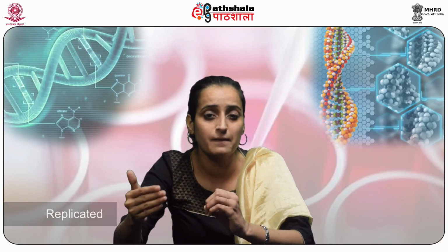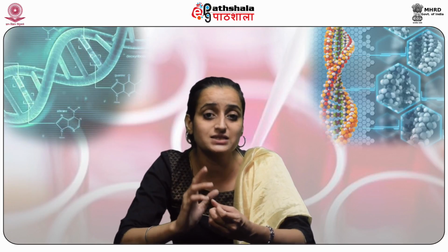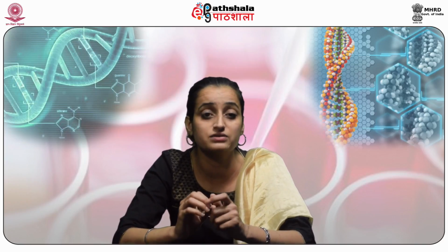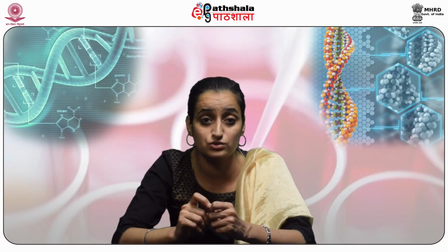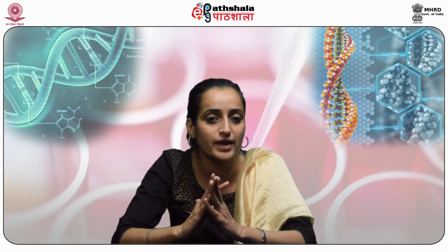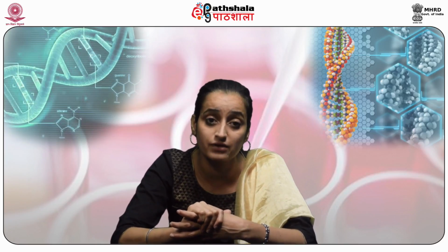The fragment can be cloned in a plasmid, replicated in bacteria. Bacteria then can be lysed to obtain the plasmid, and the plasmid is then purified, and in the end, restriction enzymes can be used to excise out the fragment of interest to be used as a probe. RNA probes, on the other hand, are 250 to 1000 base pairs in length. RNA-RNA hybrids are very thermostable and are resistant to digestion by RNases. So, post-hybridization washes with RNase can be done, making it possible to remove any background stain or non-hybridized RNA.